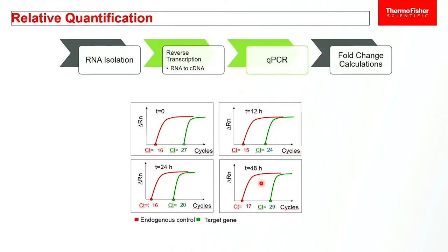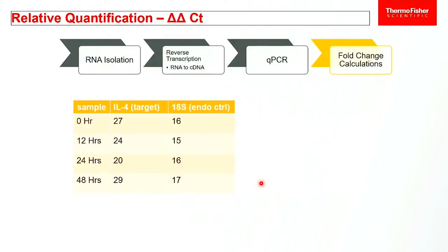Okay, so those are the metrics of 4: 0 versus unknown, target gene, control gene. All right, and then we can tabulate the data. Great, tabulating data. But again, remember, all of our calculations are based on differences. So we got to start doing some delta calculations. Remember, that was one of the names that we gave this, a delta-delta CT. And that's what we're going to do with our data analysis. We're going to generate not one difference, but two differences. So we call it delta-delta CT, or comparative CT, because we're comparing CTs.